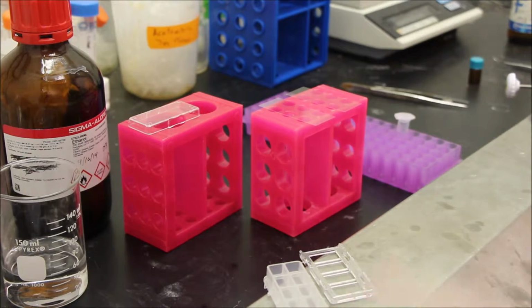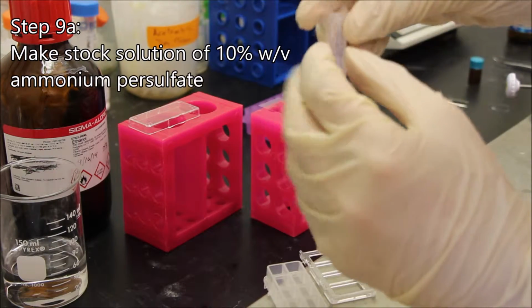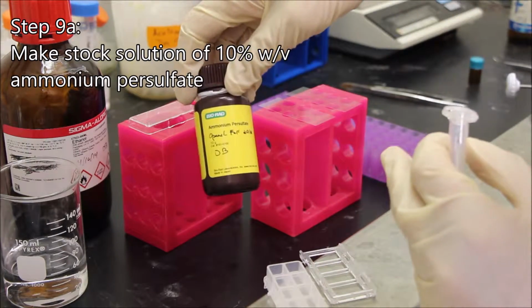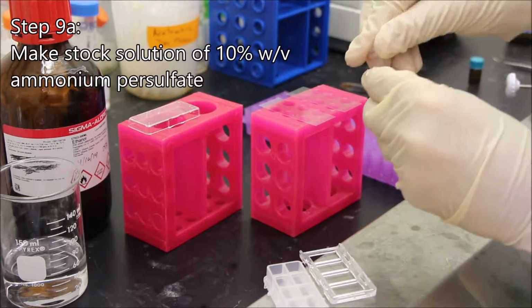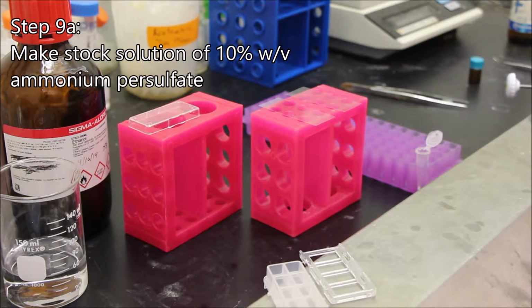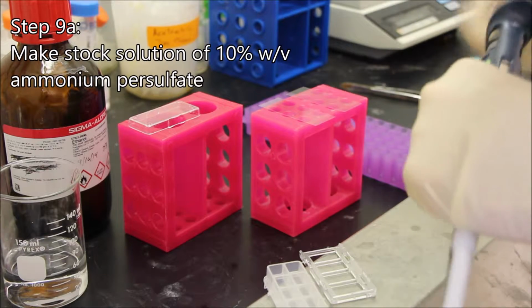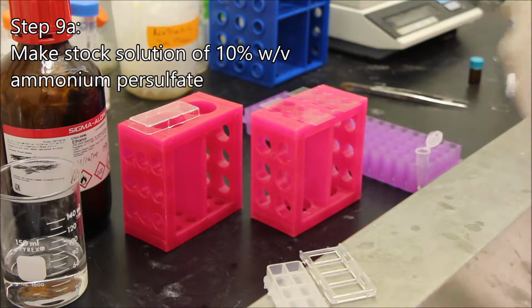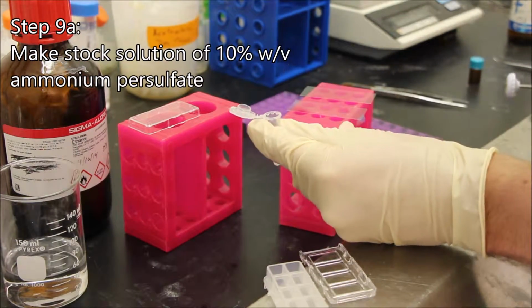Anyway, while the sonicating's going, I measured out 22.8, it doesn't really matter, I measured out some ammonium persulfate. You can get it from Bio-Rad. Measured it out, there's 22.8 milligrams here. I'm going to open it. I'm going to add 228 microliters of water to this.